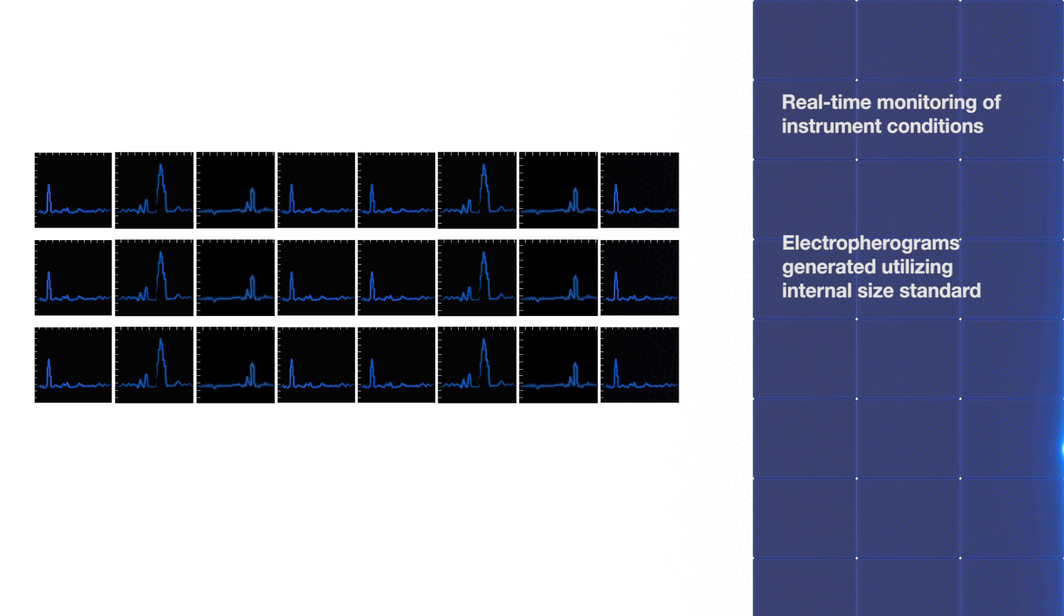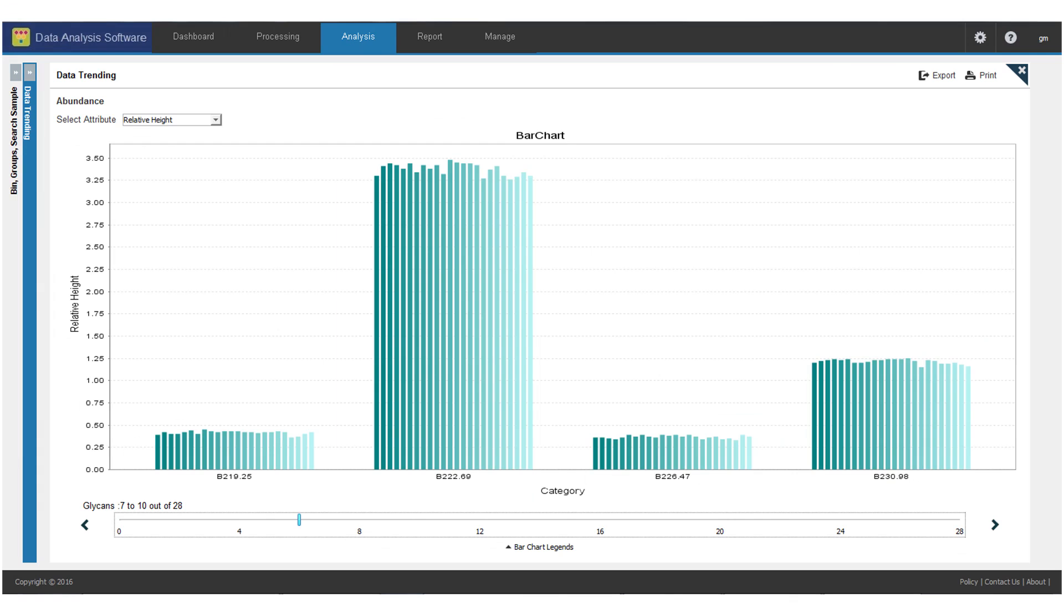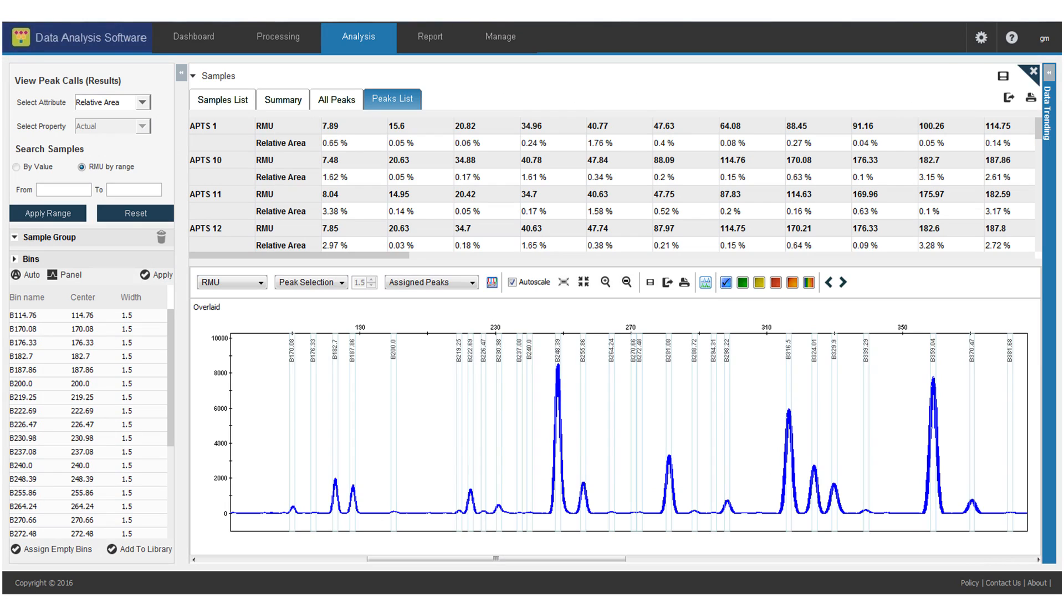Different datasets, such as those generated by glycans labeled with APTS, turquoise, or teal, can be selected and further analyzed with trends and reports.